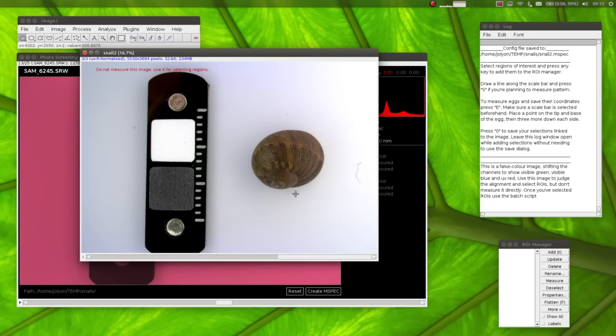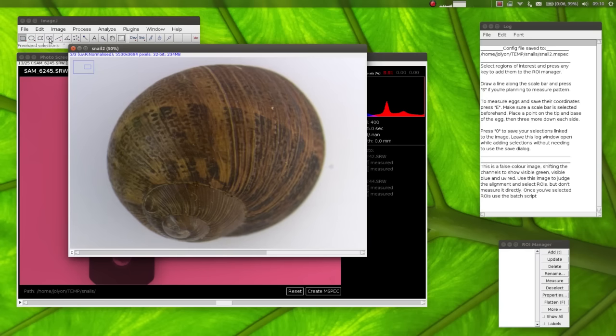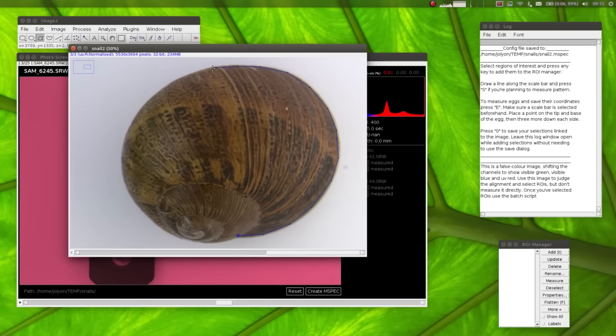So this image looks good, and again we want to select the regions of interest, so I'll just very crudely select the snail. When you hold down the space bar, it lets you drag an image. It just momentarily changes the cursor into a hand dragging tool. So I'll just show you. When I'm holding down the space bar, I can drag, release the space bar, and I can resume selecting. And you can double click to complete that.